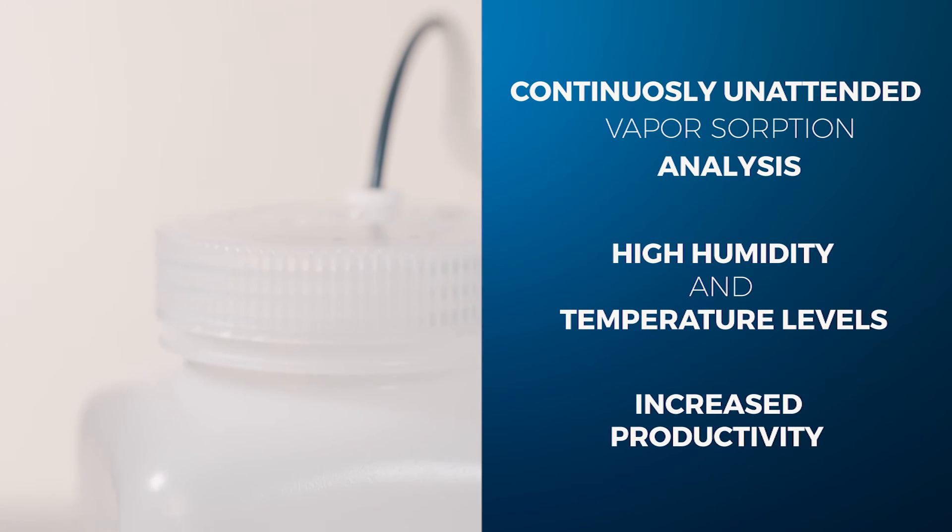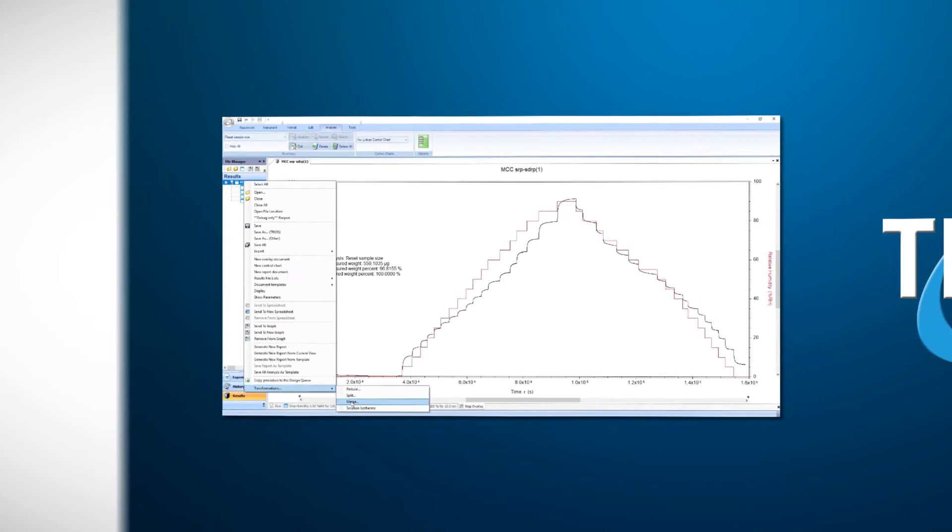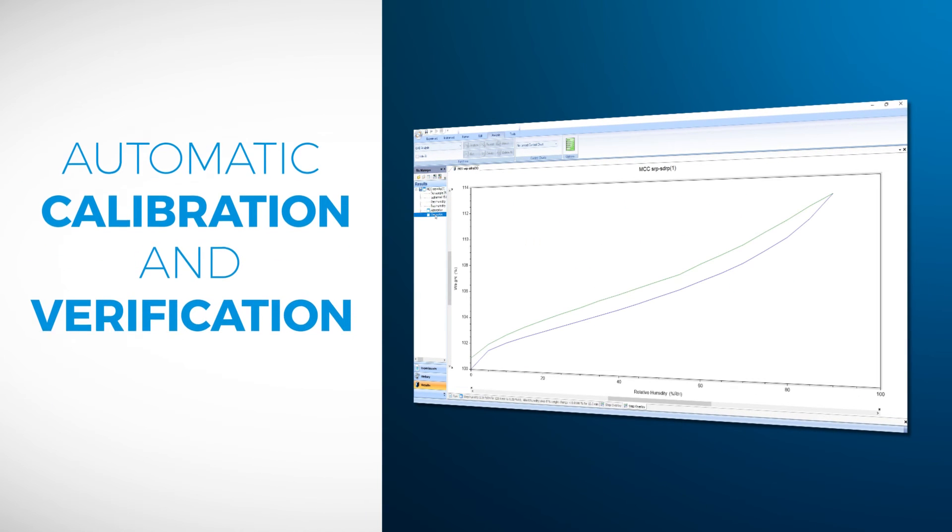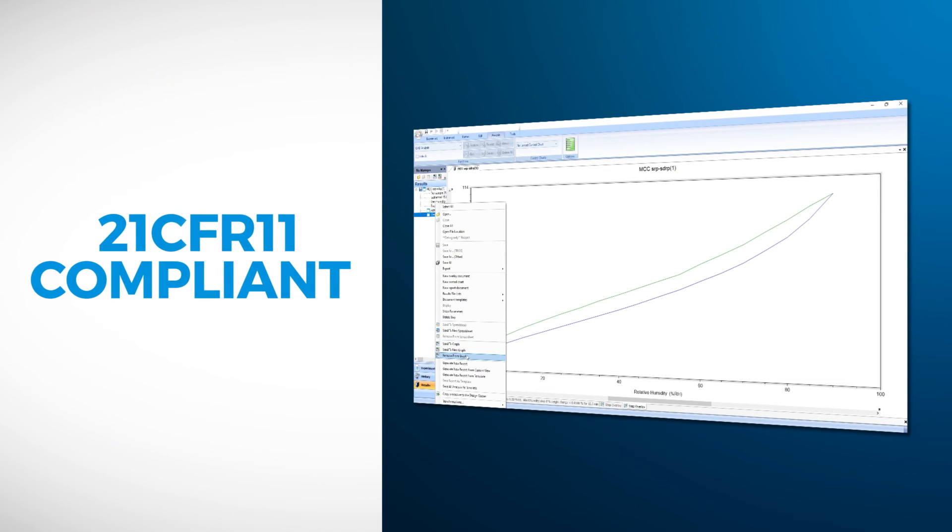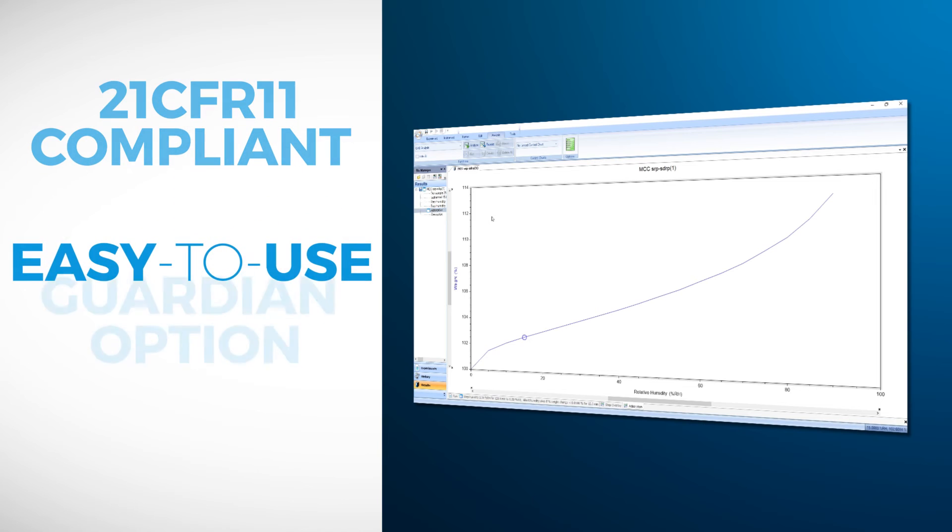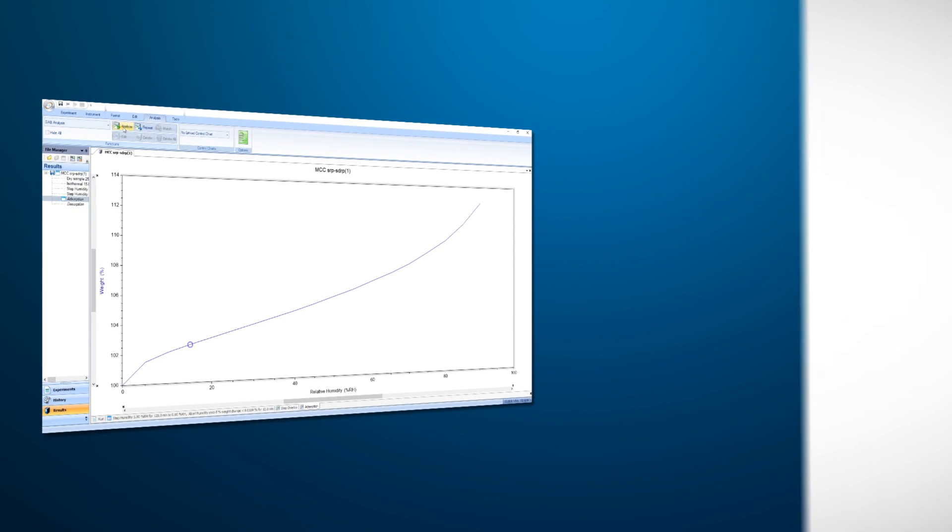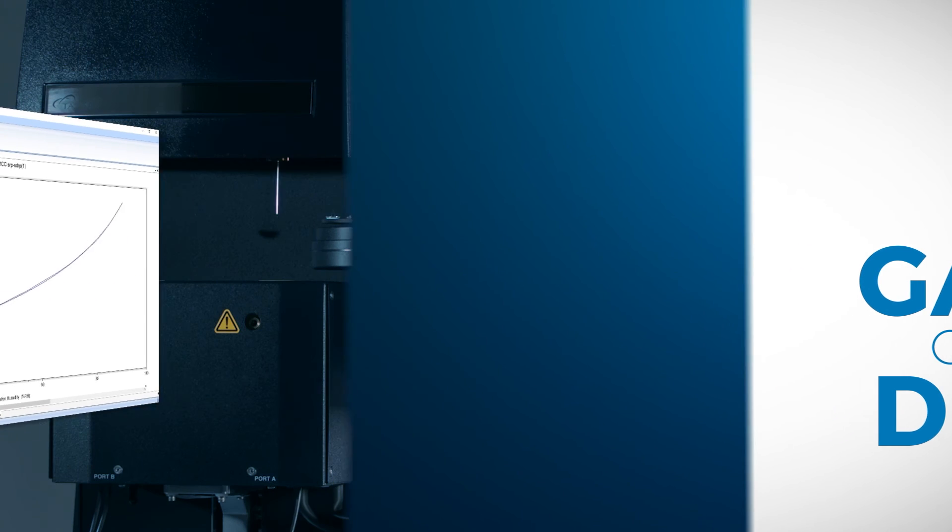Designed to further increase efficiency, TA's powerful TRIOS software offers many useful functions, including automatic calibration and verification, as well as model fitting. TRIOS is 21 CFR 11 compliant through the easy-to-use Guardian option. Fitting sorption isotherm data with available models like GAB or DLP provide parameters allowing to calculate characteristic properties, such as monolayer capacity and surface area.